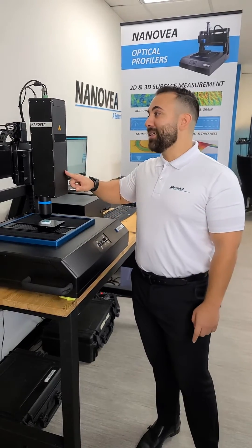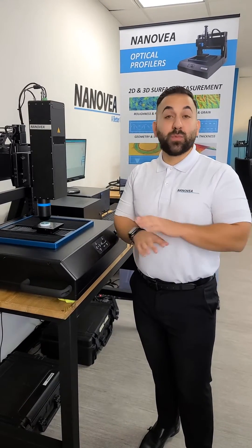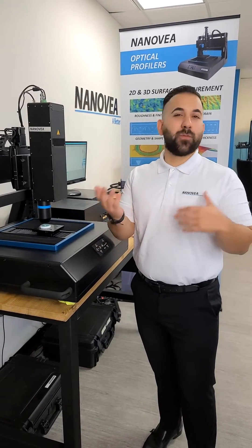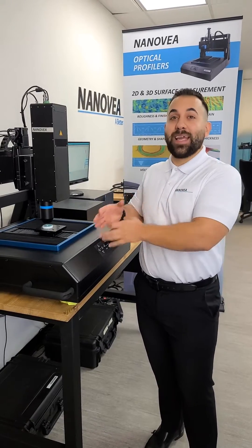The crazy thing about this high-speed sensor is it measures 384,000 points per second, which is ridiculously fast. Compared to a lot of different profilometry, we're about 2,000 times faster than them when scanning an object.